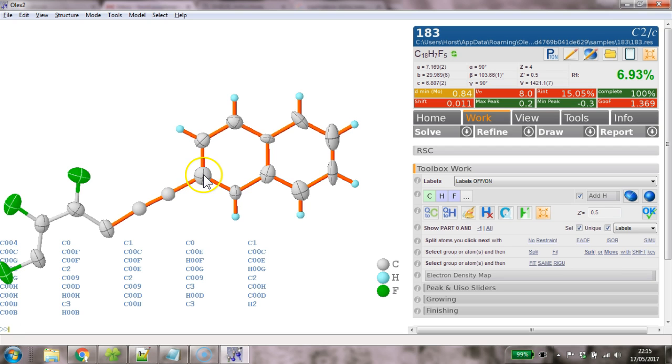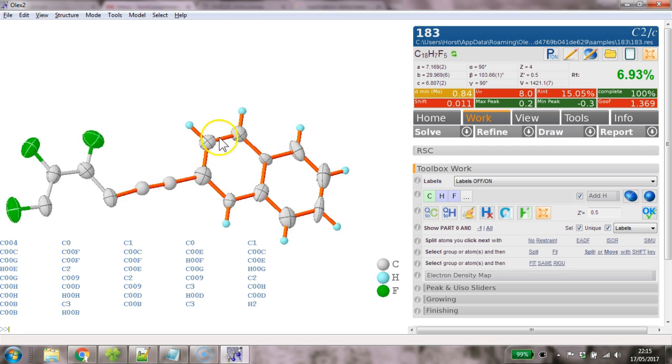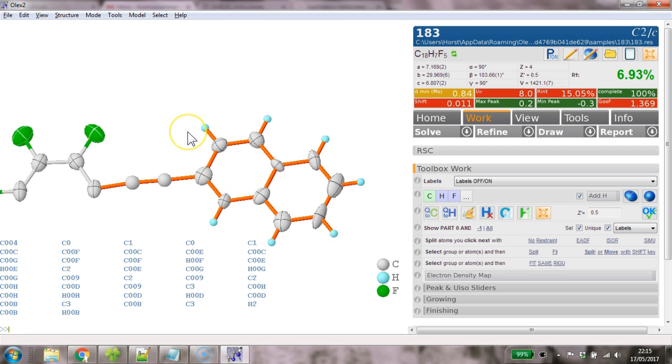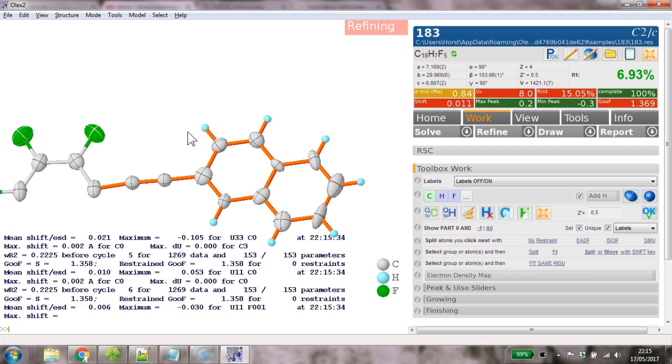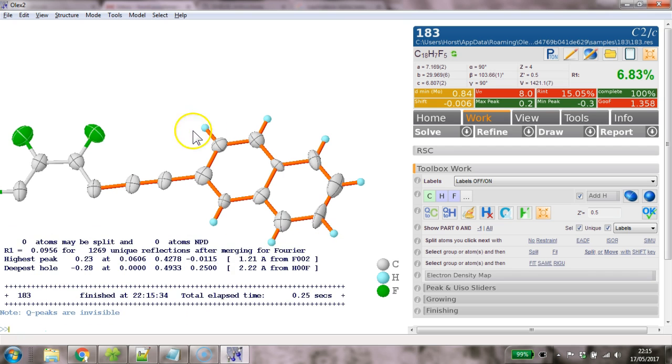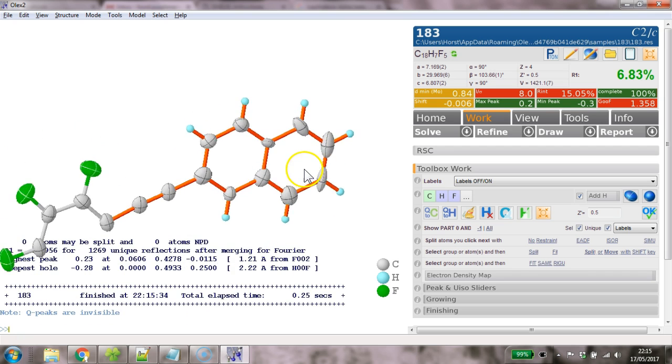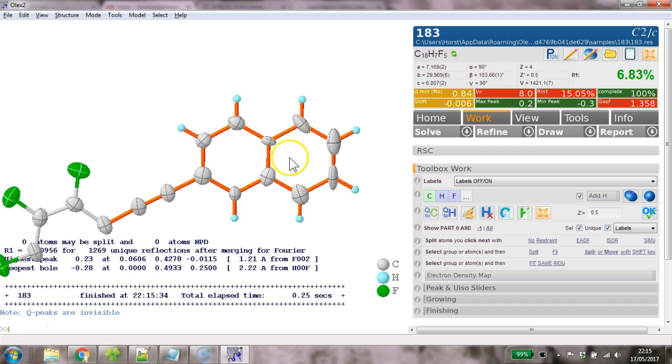So here we go. So we've got the part minus one showing. Now we make everything anisotropic, refine this and this looks not too bad.